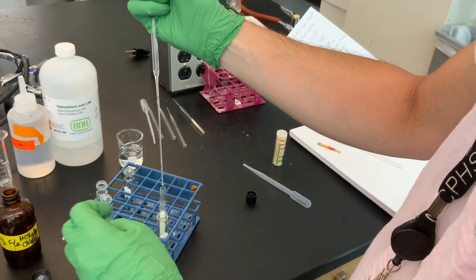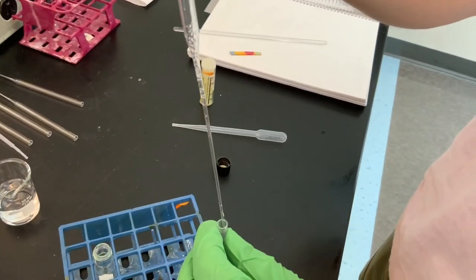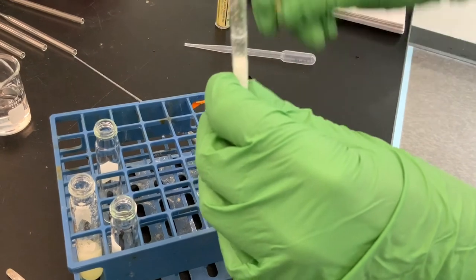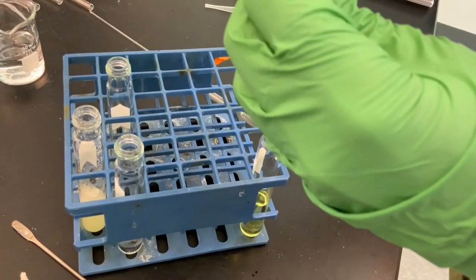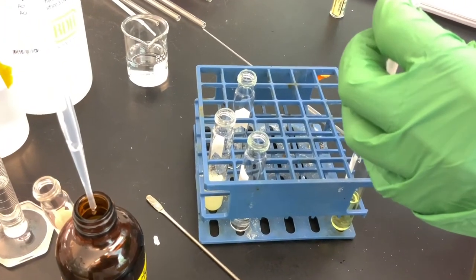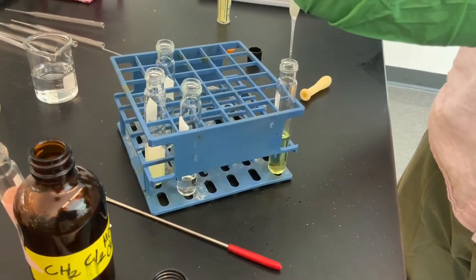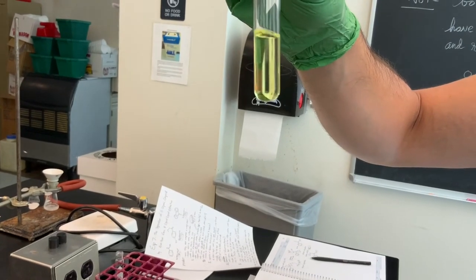And I'm gonna pick up the column because I wanna get the tip out of the methylene chloride in the bottom part. Right, I'm seeing that most of it has gone through. Remember the trick that I did last time, which is just give it a little pressure to really push everything out of there. And then it doesn't hurt to use a very, very, very small amount of methylene chloride to rinse the sides of this Pasteur pipette, which was submerged in that methylene chloride layer, so that I'm really getting rid of every possible trace of it and into the now dry methylene chloride in our tared culture tube.